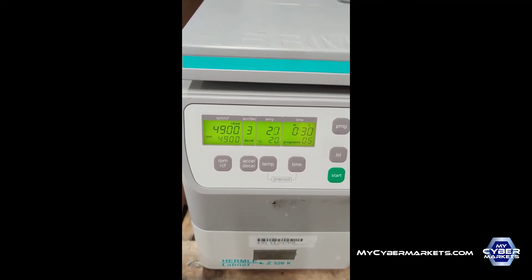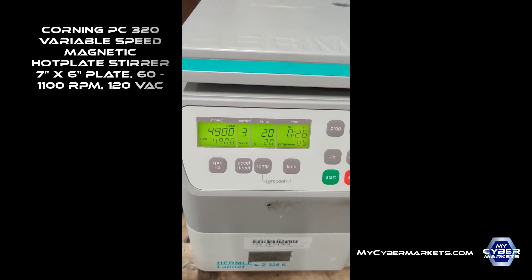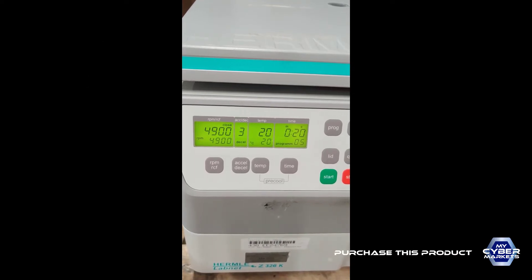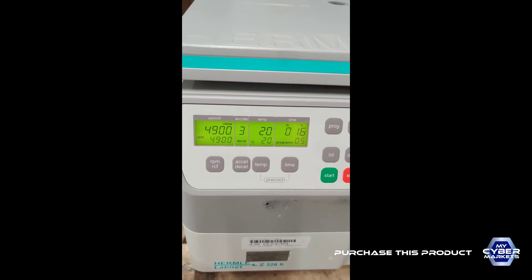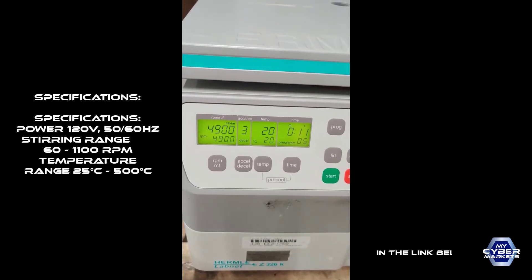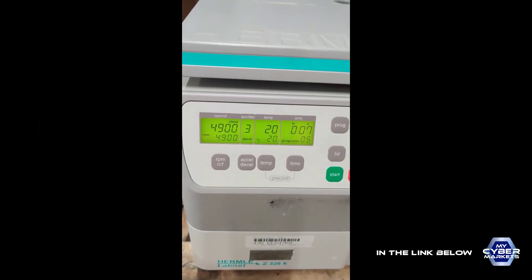We set it at 4900, it's running with a 3 acceleration and acceleration ramp, 20 degrees, we program it on program number 5. It's running and will stop in a couple seconds. It's working fine, it's cooling fine, it's getting up to the speed, and now it will stop.